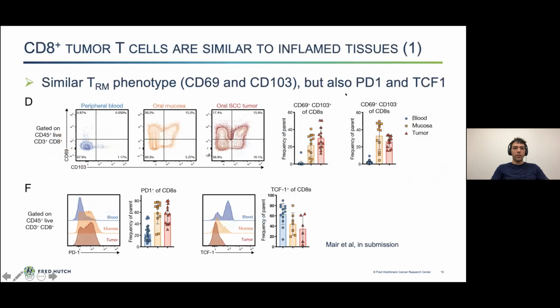I'd like to start off with the cytometric profiling, where we first focused on cell types that have been described in the literature as being critical for anti-tumor responses, which are those TRM cells that I mentioned in the introduction. Tissue-resident memory T cells have traditionally been defined by the co-expression of two markers, CD69 and CD103, and have also been reported to express PD-1 to some extent.